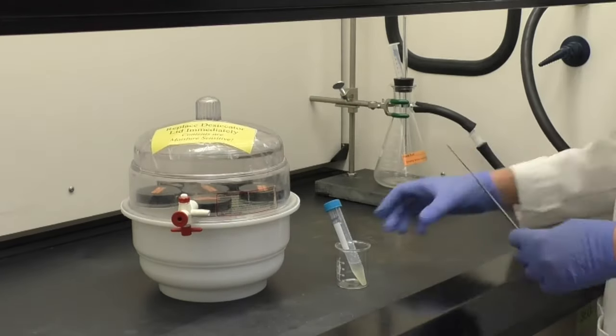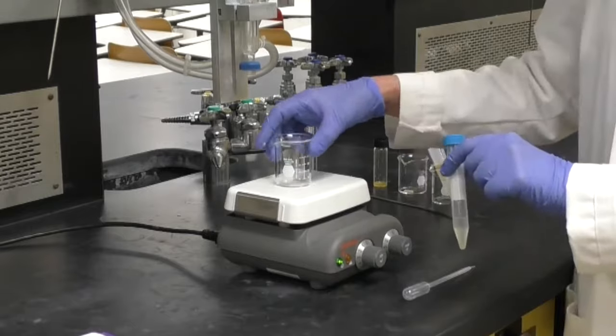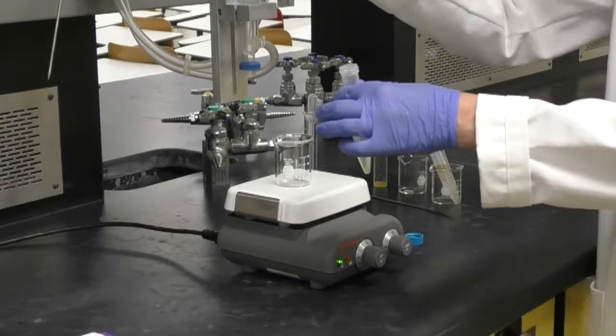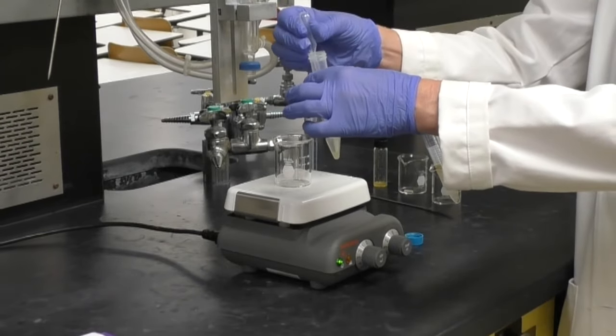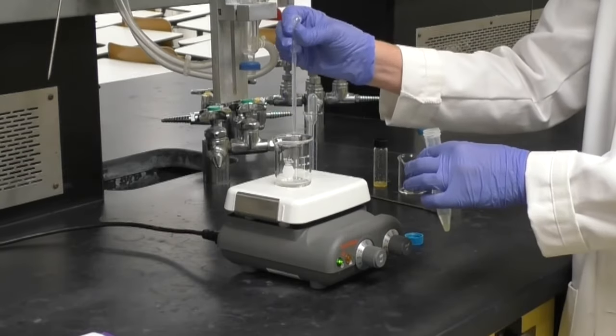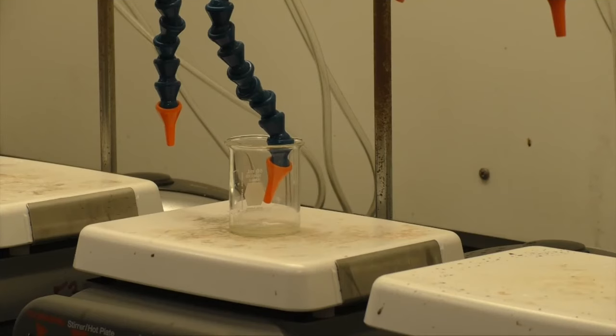Allow the sodium sulfate to separate from the liquid and then pipet the liquid into a 50 mL beaker. Use the blow-down station again to remove any remaining ether. A residue of limonene will remain.